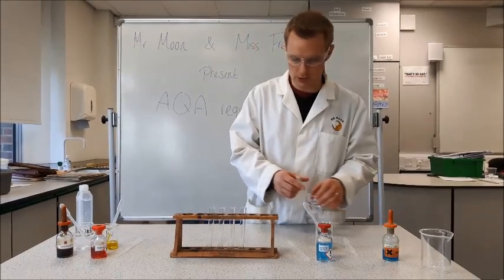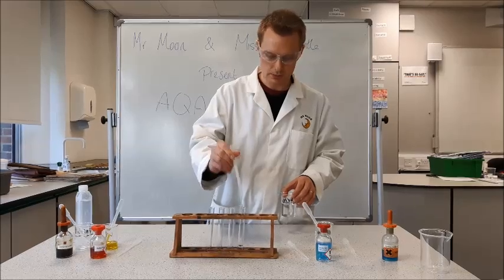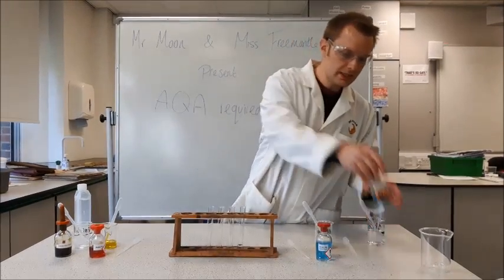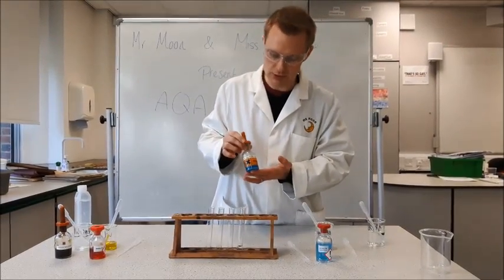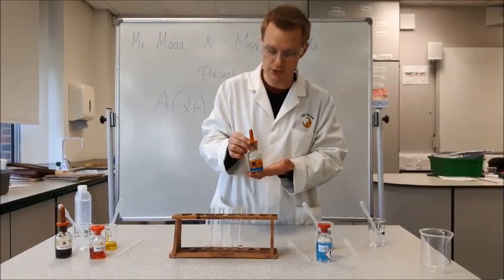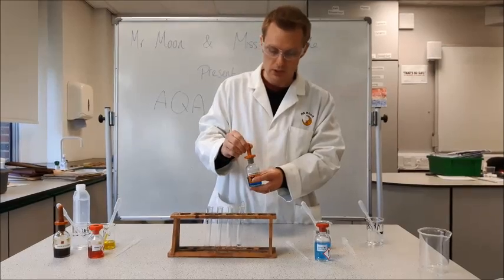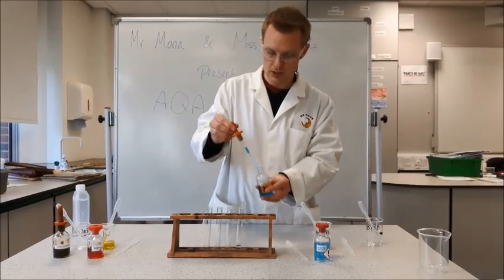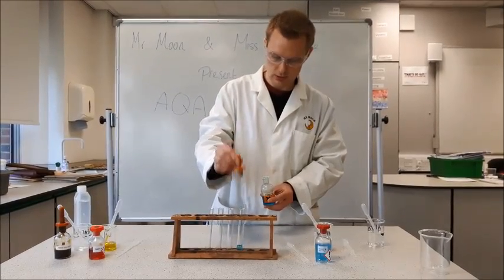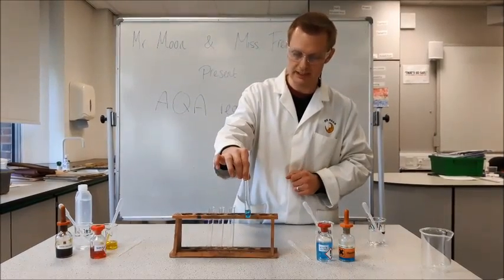I'm going to start with glucose. I'm going to add a sample of glucose to my test tube, and then I'm going to use Benedict's solution. This is a harmful solution, so if you spill it on your skin you need to wash it off straight away. Goggles should be worn at all times. It's blue in colour and I'm going to add a few drops — you can see at the moment it is still blue.